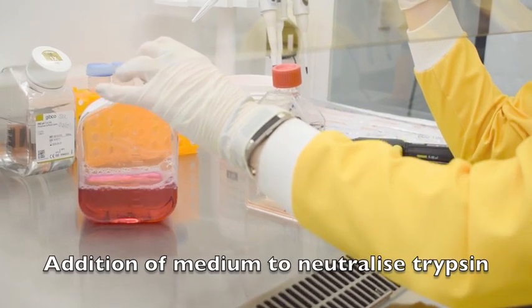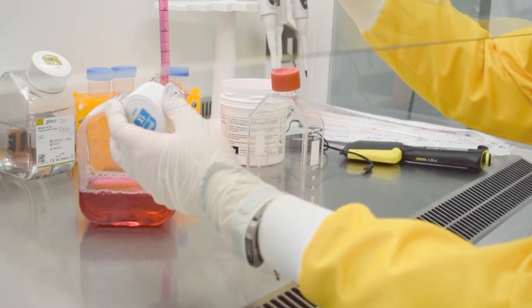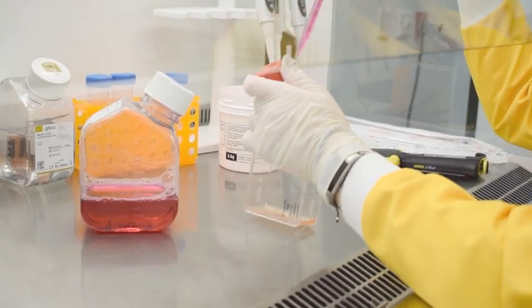A volume of fresh culture medium is added to the cell suspension. This helps neutralize the effects of trypsin, preventing over-trypsinization of cells.